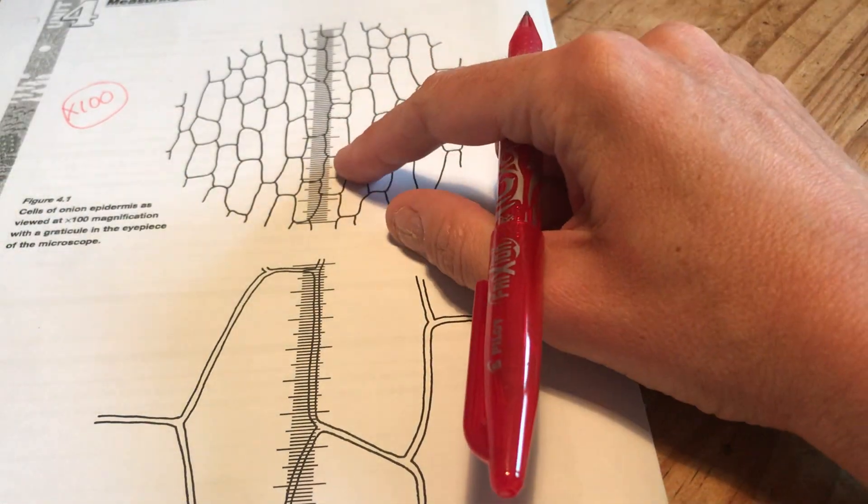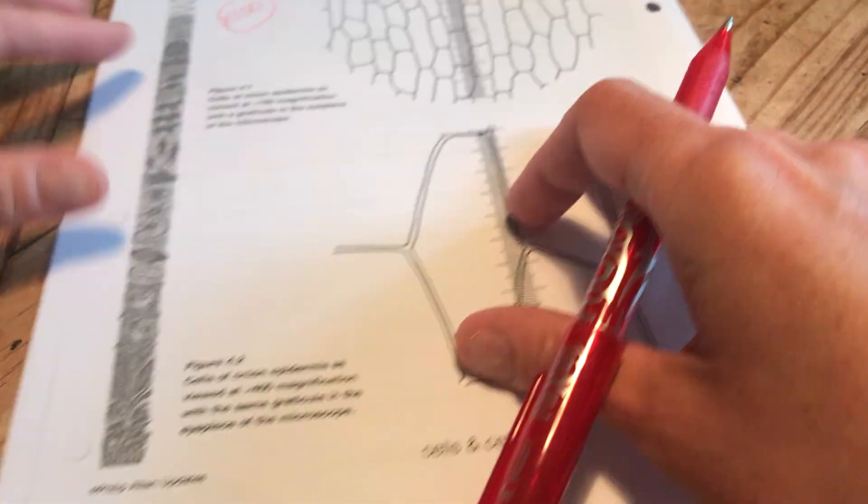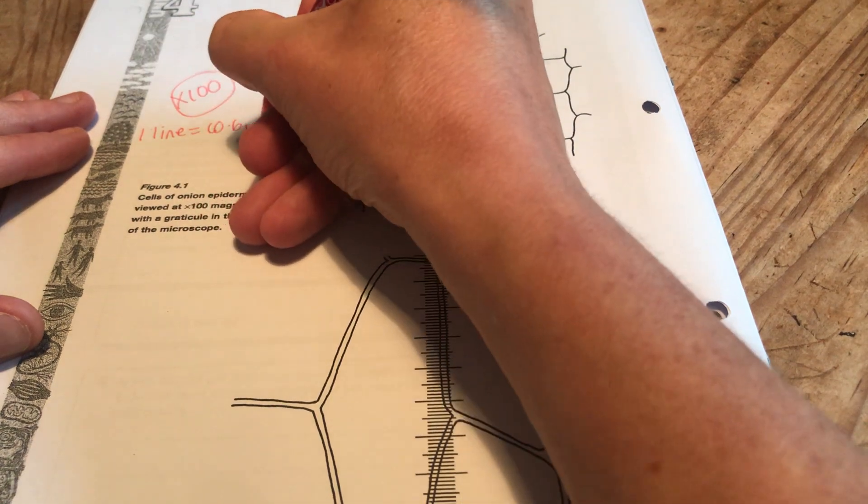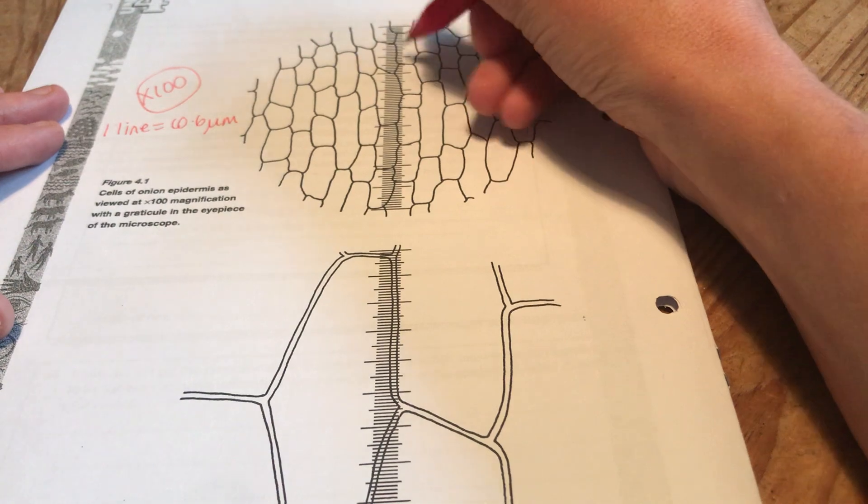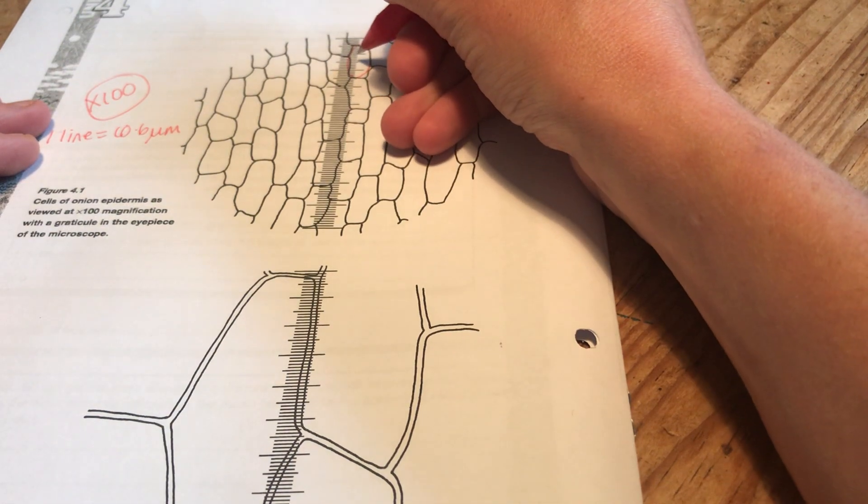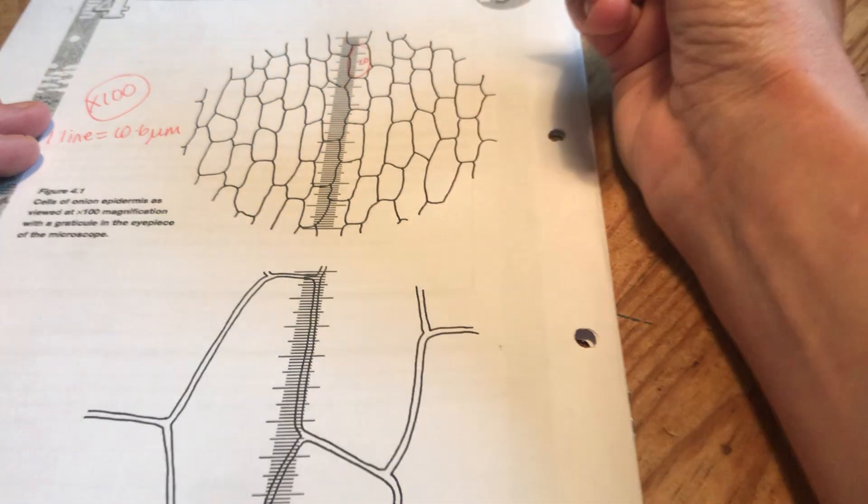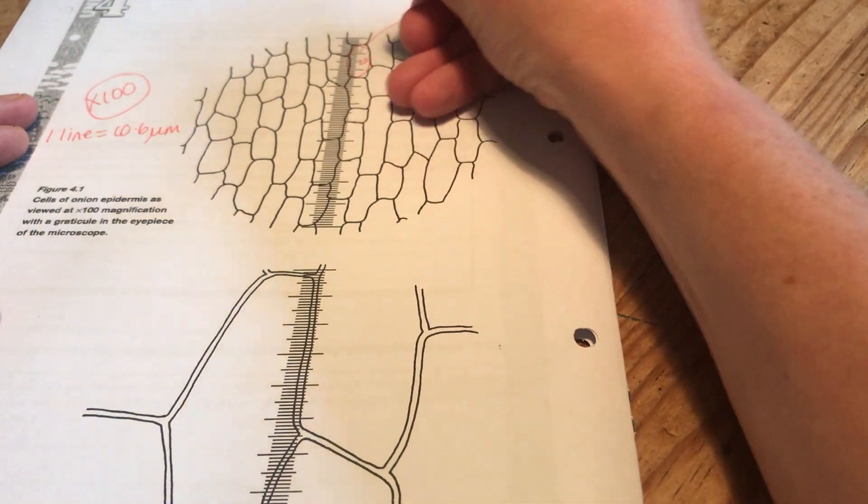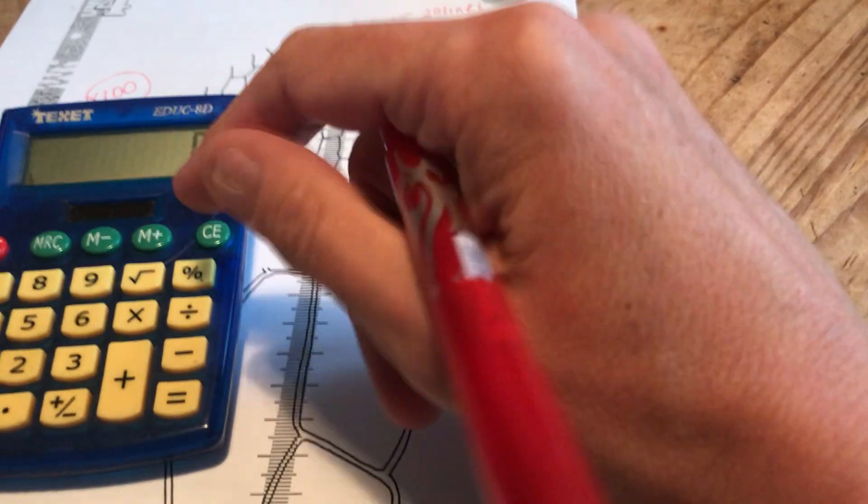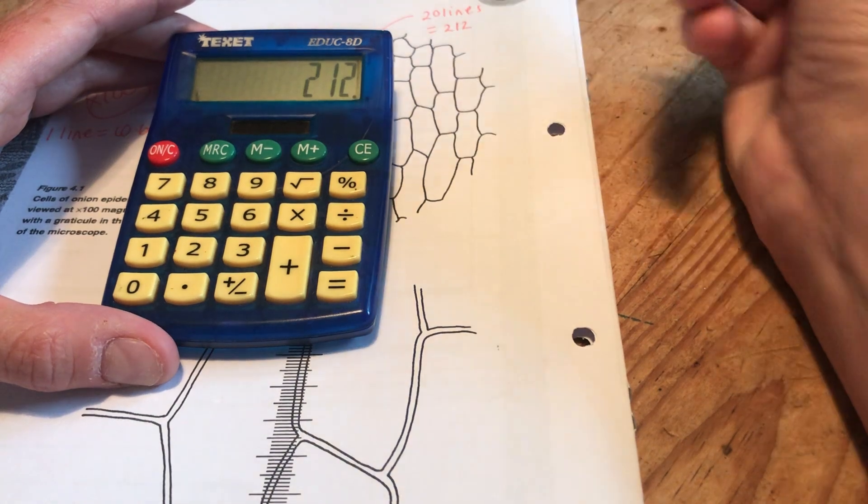I know on this diagram the length of one line, one line represents 10.6 micrometers. So I could say well okay let's do a mean of a few cells. Let's take this cell here and that cell there if I count it is 5, 10, 15, 20 little lines big. So that cell there if it's 20 lines and each line is worth 10.6 micrometers.